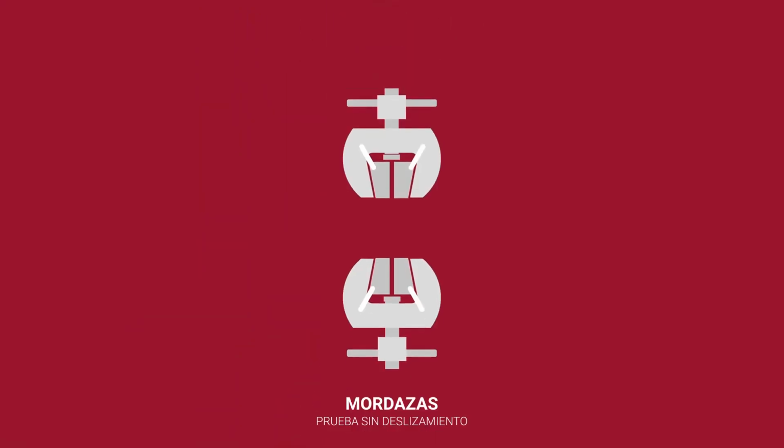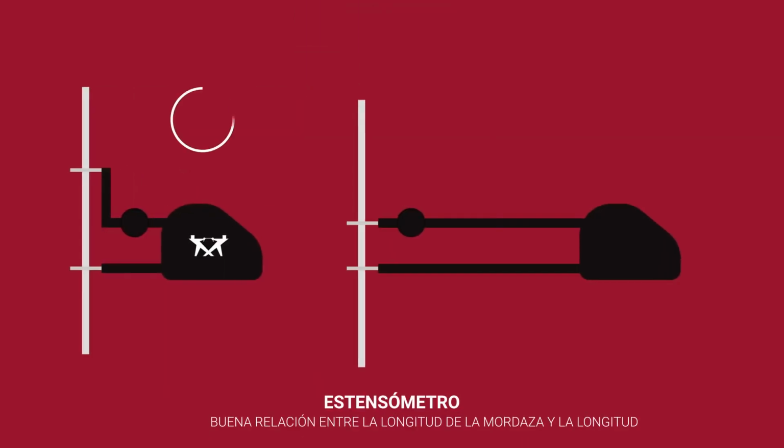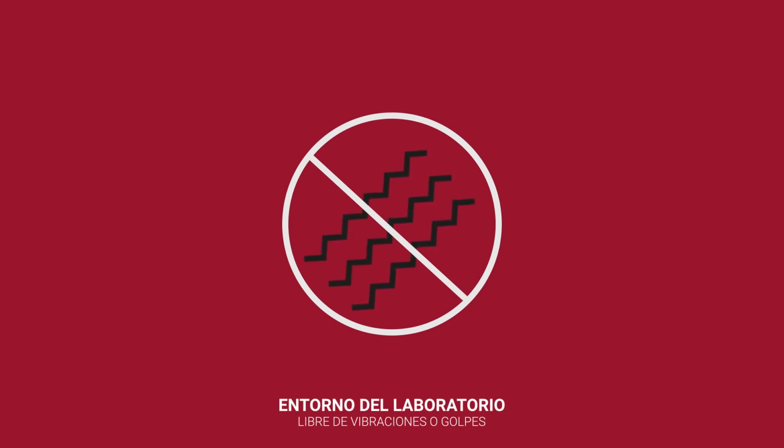It is vital that the gripping technique provides sufficient clamping force and minimal compliance, with jaw faces in good condition. The extensometer needs to be securely attached to the specimen, with knife edges in good condition. It must also be appropriate for the expected travel distance to minimize the effects of vibration and have a suitable ratio of parallel length to gauge length. It is important that the testing machine and extensometer be isolated from any sudden or repetitive vibrations or shocks, as this could cause interference with your testing.